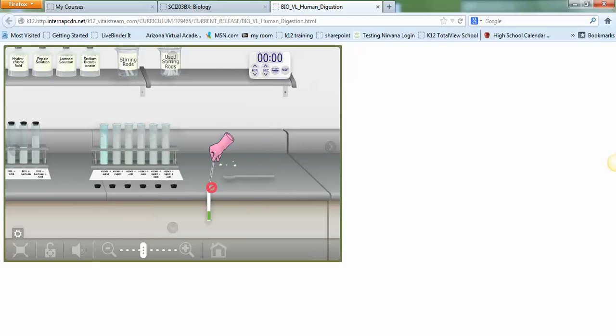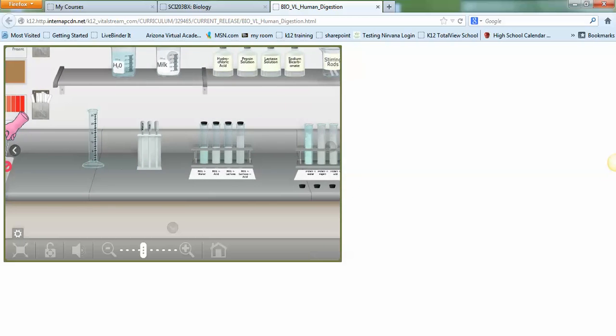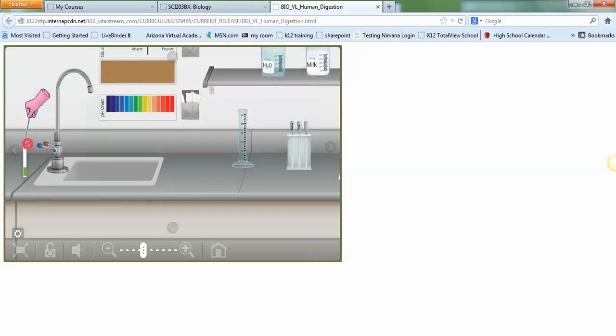Oh, it looks like I want to drop it on the floor here. Oh, goodness. Bloopers. This should go on the virtual lab bloopers, huh? I can't let go of this test strip. It's stuck to me forever.